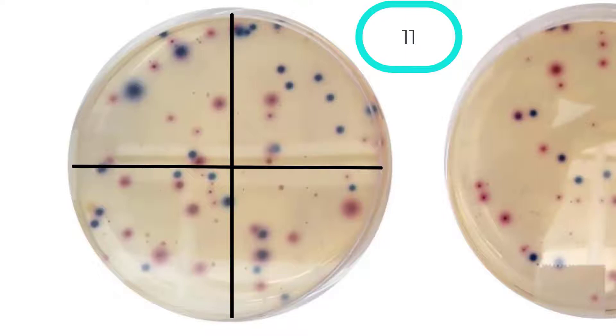Let's continue to count the E. coli colonies in each quadrant, moving clockwise from the top right. Continuing the count from 12 through 27, we have 27 E. coli colonies on this plate.